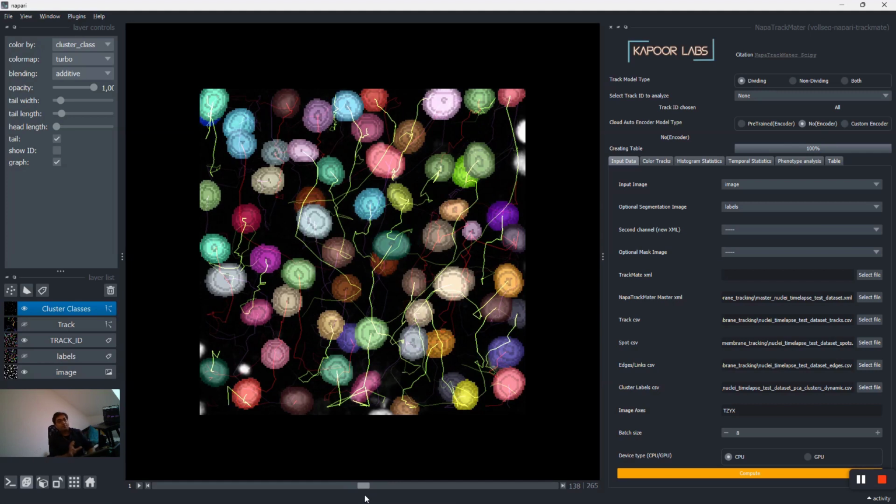And then you have a whole workflow that is complete. You use Vollseg napari to get the segmentation of your 3D cells. You use an autoencoder model to get the point cloud representation. You use that to compute, or update, all the features of the cells in your tracks. You can visualize them and you can cluster them into classes, and now you have a wholesome analysis of your tracks, which is covered with a lot of deep learning approaches, and so is very accurate if you have trained the models on your own data.